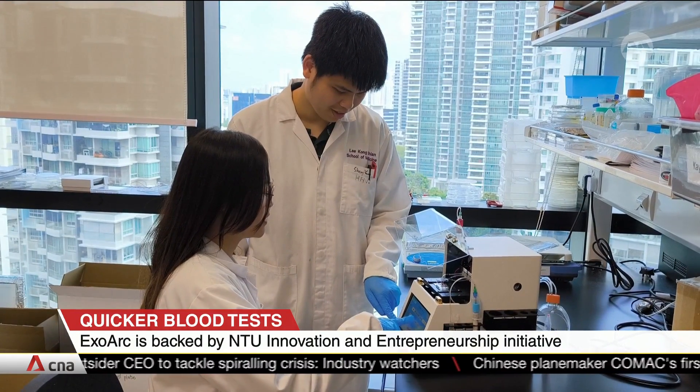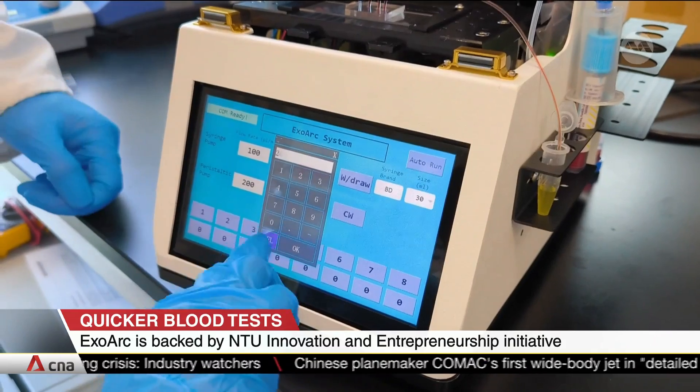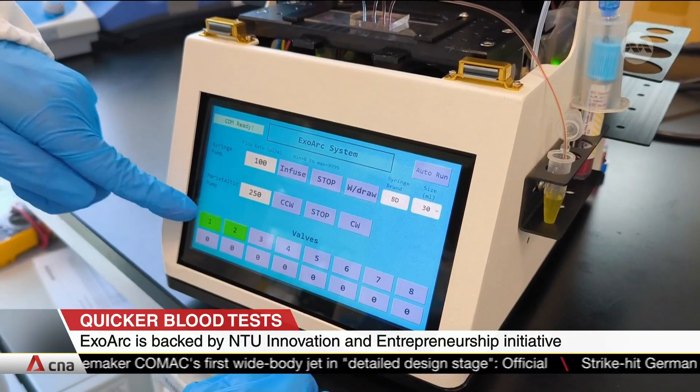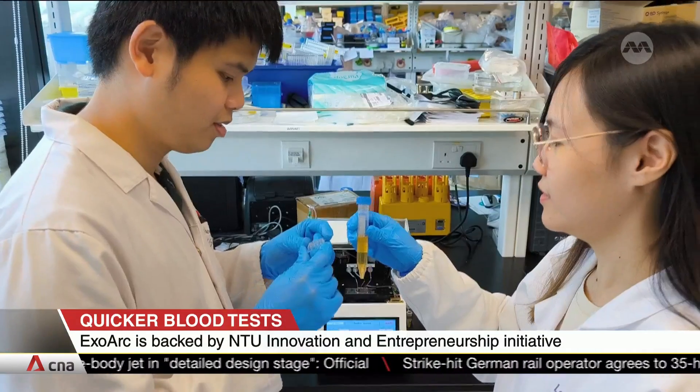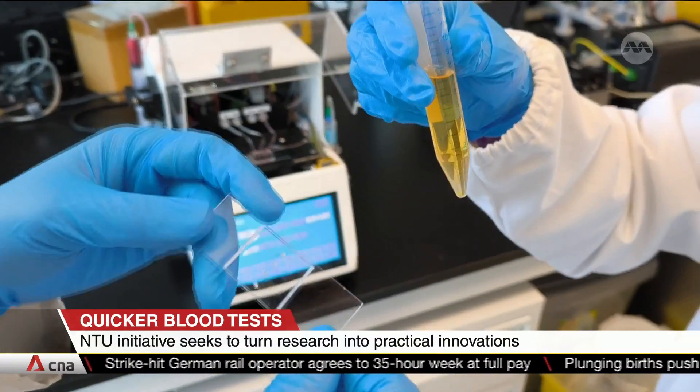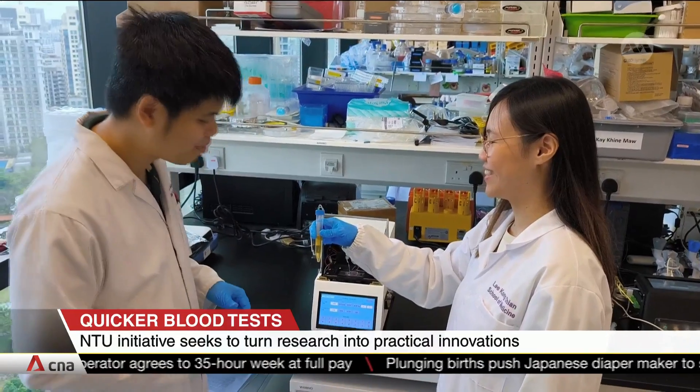The machine can essentially be used by anyone who typically needs to do blood work in any laboratory setting. But we think the greater value this EXOARC can offer is targeting highly sensitive tests — for example, the testing of genetic markers that is widely used in precision medicine. This is because for genetic materials, the target genes you want to detect are usually very low in abundance in the blood, making detection highly variable. Having good sample preparation is therefore very important.